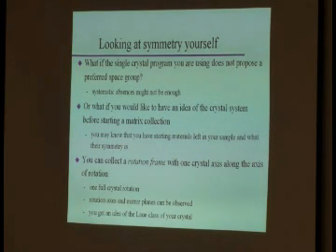There's something called a rotation frame, where you do a full crystal rotation and you get a spot pattern, which allows you to see rotation axes and mirror planes. So it's kind of similar to what you get out of a Laue setup. You get some view of the reciprocal lattice. So you can get some kind of idea of the Laue class from a normal single crystal diffractometer too.